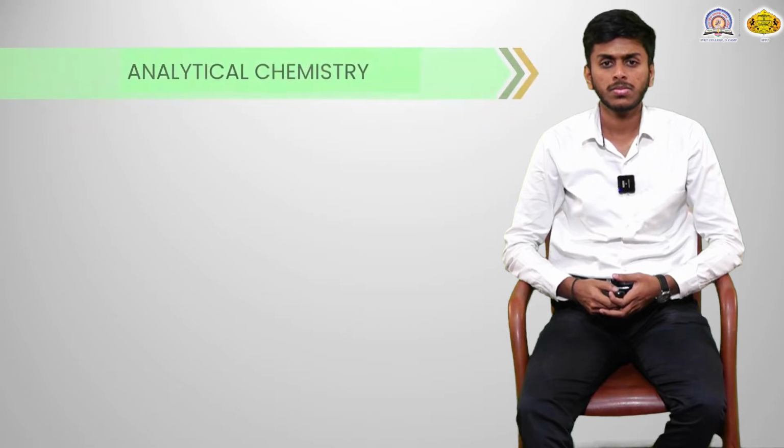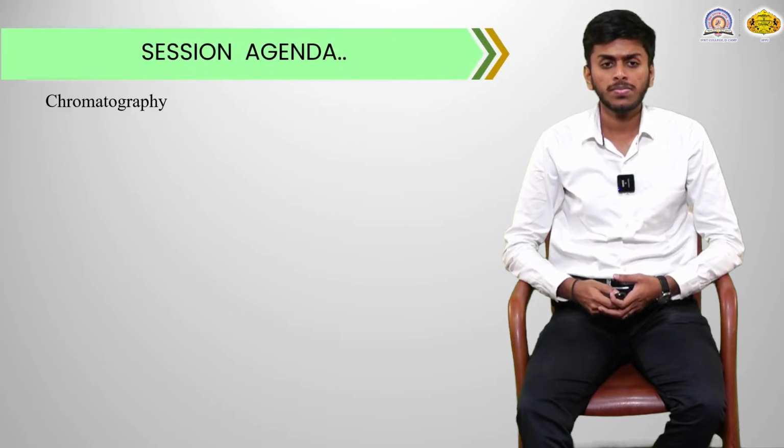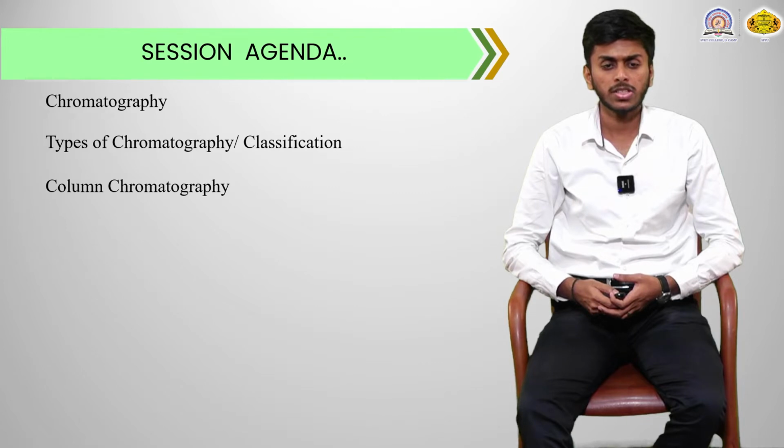In today's lecture, we are going to learn about chromatography, its introduction and types of chromatography. So let's get started. Chromatographic techniques. Session agenda. In today's lecture, we are going to learn about chromatography, types of chromatography, and its classification.